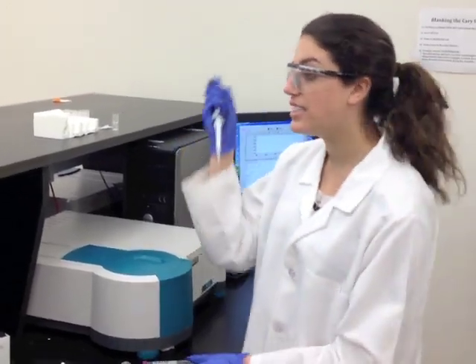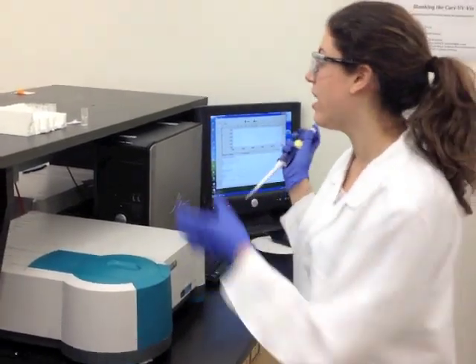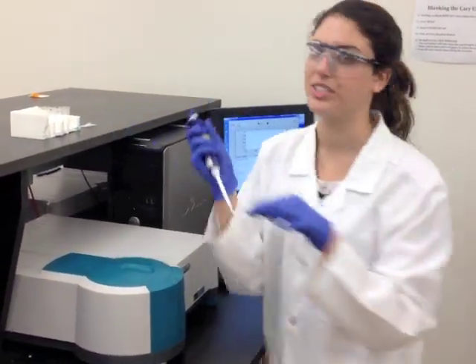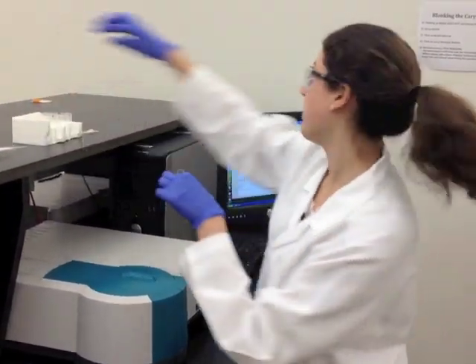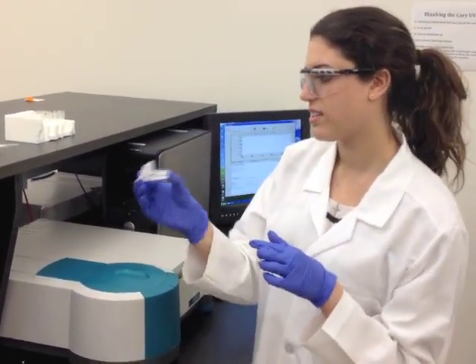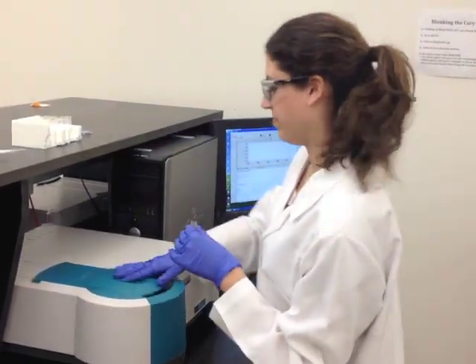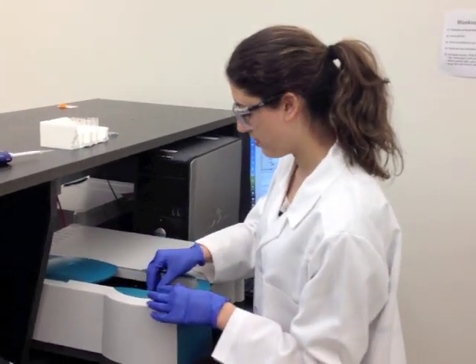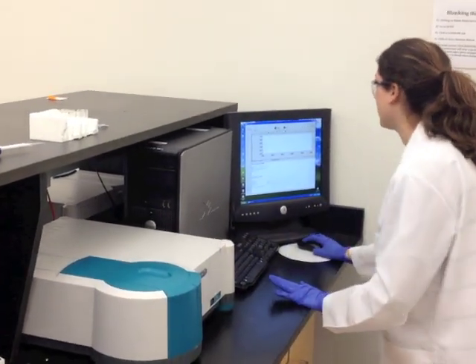I'm taking 10 microliters of the riboflavin binding protein and putting it in the neutral red solution. Now I'm going to mix it with parafilm and put it in the spectrophotometer. And press start.